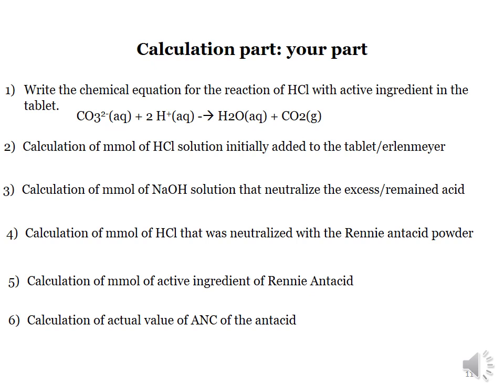Again, you have to go back to know the definition of acid neutralizing capacity and how we can calculate it. And this was not the last part. The last part is to calculate the theoretical value of acid neutralizing capacity. This and other details will be discussed during our lecture, in addition to your questions. Thank you very much.